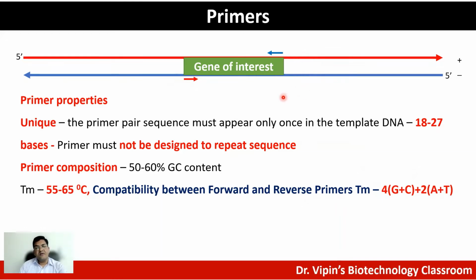Now, the challenge in primer designing is how close you can design a primer to your target. So that is where the primer designing comes in. You also need to avoid dimer or hairpin loop formation. So one may argue that if you want to increase the TM, you could increase the length of the primer, but there are reasonable restrictions to how long a primer can be.